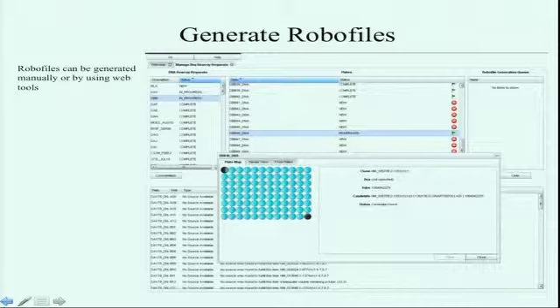Now here is just an example of one of our web tools. Here, you can customize your plate layout, where you can decide which reagents you would like, whether there's a certain order you would like them on the plate, or if you want to completely randomize, you can add in controls or add in any empties you like. Also within the web tool, it'll tell you what reagent it is, the tube barcode itself, even the volumes that are available, and also give us alerts if a reagent is low that we need to replenish our stocks before the requests can be fulfilled.